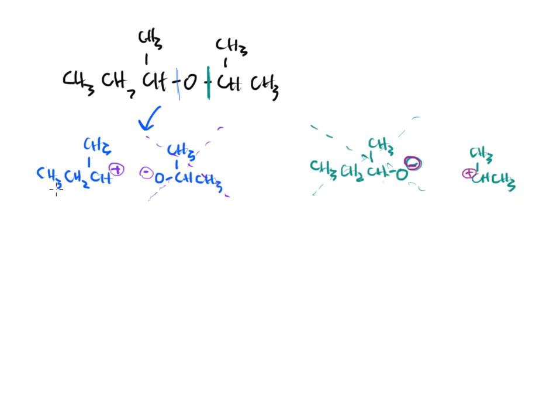So what would happen is that if I looked at the fragmentation patterns here, this fragmentation pattern up here at the top would give me about 116. I would see that signal. If it cleaves to the left, well, this one will never be seen. This will be my positive piece that will be seen by the detector, and this will give me a signal of around 57. 12, 12, 12, and 12 is 48, then 9 more from the hydrogens makes 57.